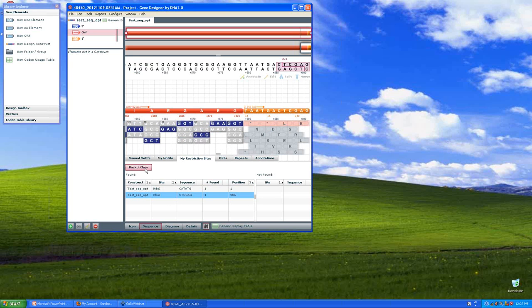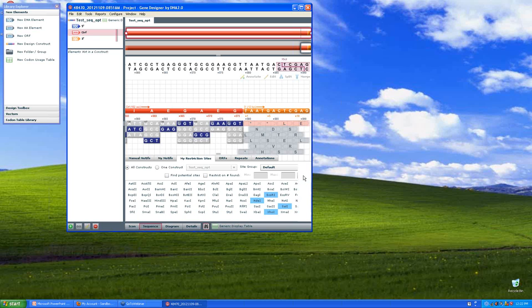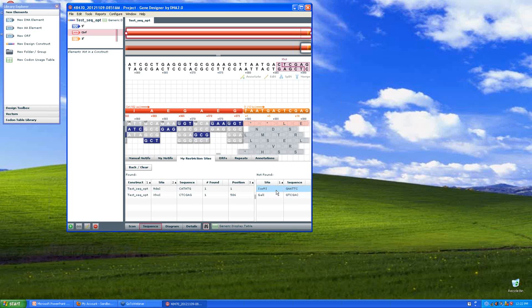If there were other restriction sites that I cared about, let's say ECOR1 and how about SAL1, I could add those to my query. Click find. And the software is telling me that these two sites are not found, which means they don't cut my insert. And that's good because I asked DNA 2.0 to please not allow them to be present.